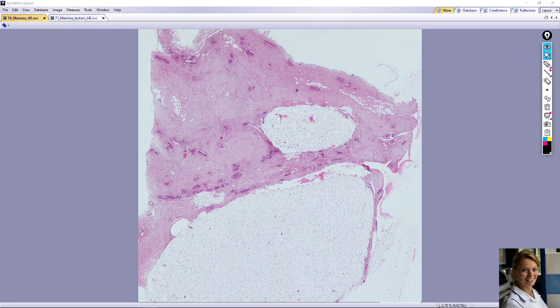In this video we will take a look at the slides of mammary gland. The slides are stained with hematoxylin and eosin. We recognize many stages of development of mammary gland, but in this video we will show only two stages.